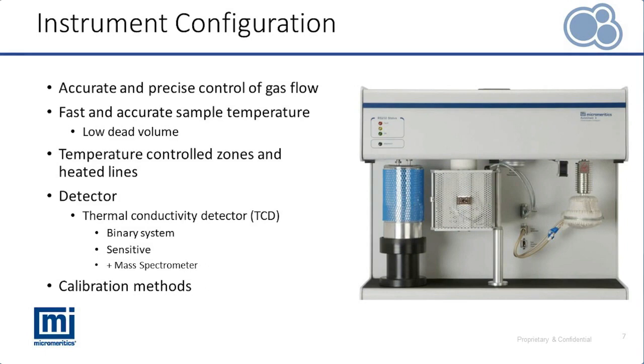During reduction, water vapors are formed as the metal oxide is reduced. The system needs to be kept at elevated temperatures and the lines heated in order to prevent condensation. Now, as reduction occurs, the reducing gas concentration decreases.